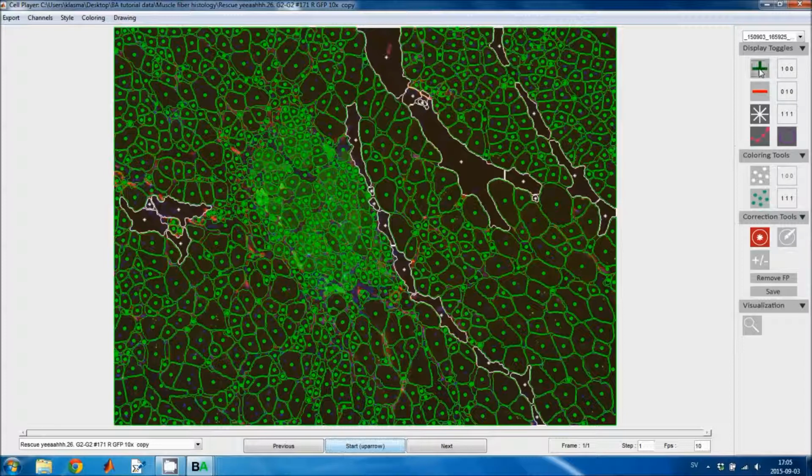Positive fibers are red. So if I press this tool here, then I can specify which fibers are positive. Oh, now I accidentally turned the display of positive fibers off. But here I can see the positive fibers that I just entered.